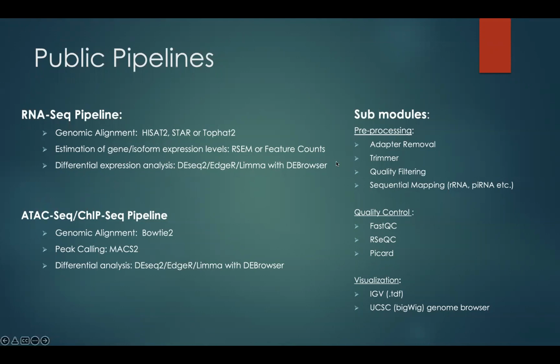You can run featureCounts first or together, get the results, start looking at them, and then in your publication, you can use the RSEM results to create the plots again, because they are very similar files. Basically, you're going to get a table of the counts, either from RSEM or featureCounts.